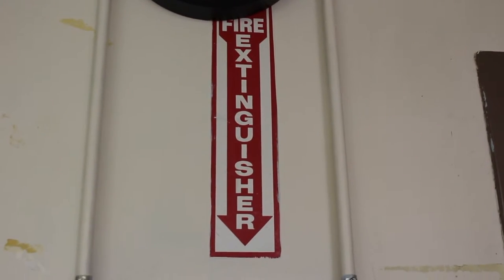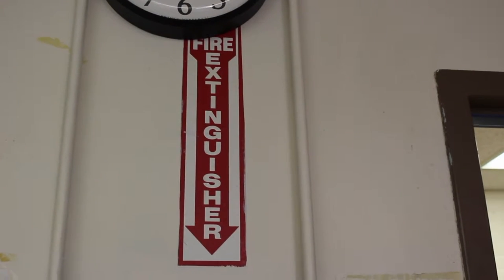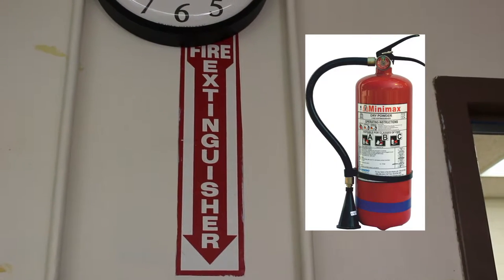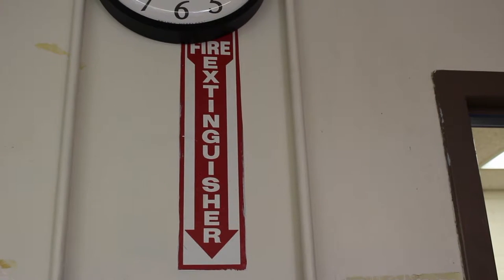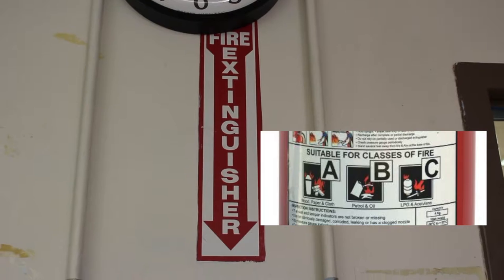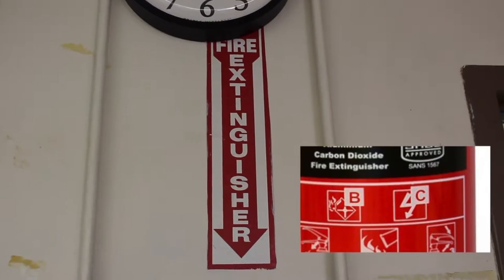Unfortunately I can't give you an up-close look at our fire extinguisher today because it's being checked. But the classic CO2 fire extinguisher puts out fewer types of fires than an ammonium phosphate fire extinguisher. You'll often see a fire extinguisher labeled A, B, and C — that's typically an ammonium phosphate extinguisher that puts out all three types of fires. A CO2 extinguisher typically only handles B and C types. In a chaotic situation, you want an extinguisher that can handle the most types of fires.